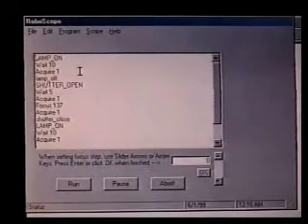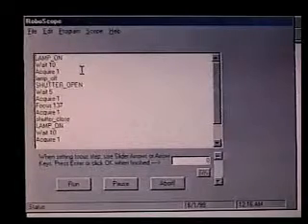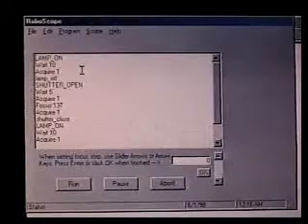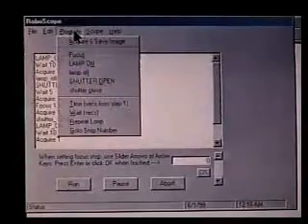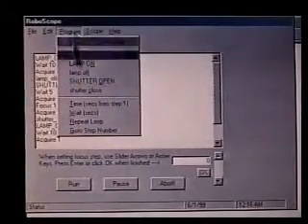And now we're going to wait. Now, depending on the time lapse movie, you might wait ten minutes or an hour. In this case, we're just going to wait ten seconds so that the program will run quickly.